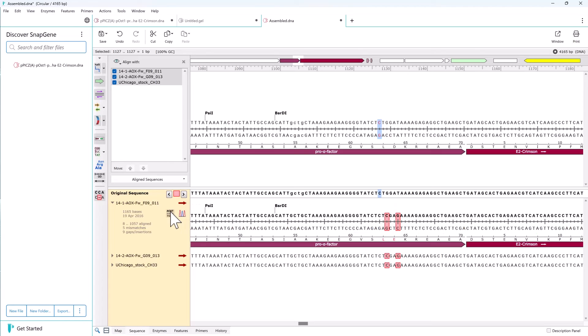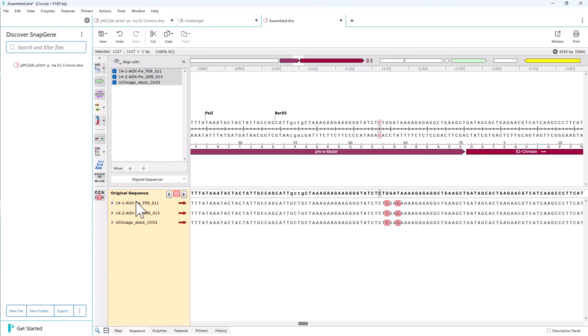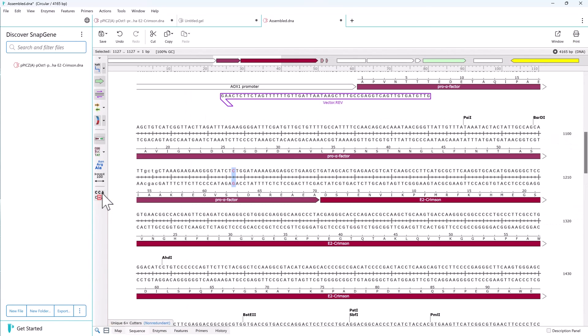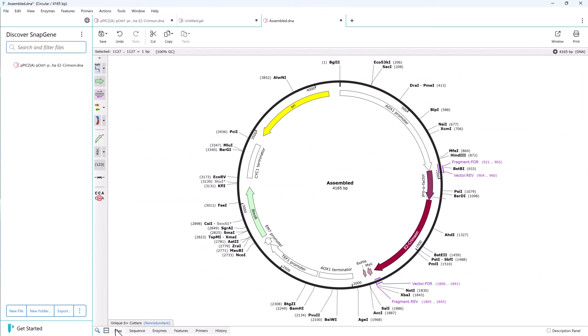And all this work we've demonstrated is neatly contained in a single file. You can hide the alignment and return to the sequence view we had earlier, or we can jump back to the map view.